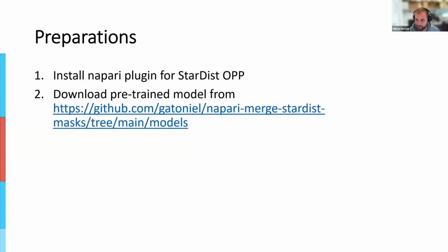Can I get kind of a hands up who wants to really follow through the tutorial and who prepared themselves? Or should I just go through what to do and no one will follow, but just watch what I'm doing? Is there anyone who really wants to follow while I'm doing the stuff? Okay, I don't see any hands up, so I'm just going to start. Oh, there's someone in the chat. Okay. Most people just wrote that they just want to watch. Okay, so I have to stop for a second and then start screen sharing again.